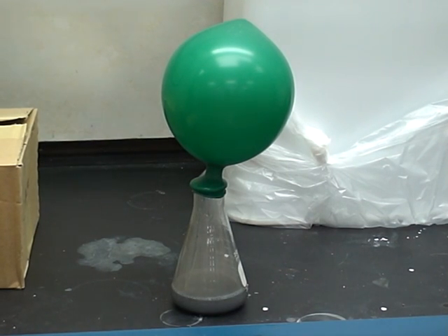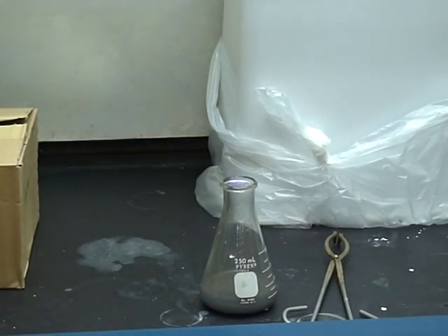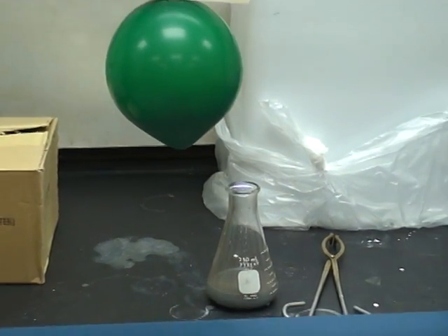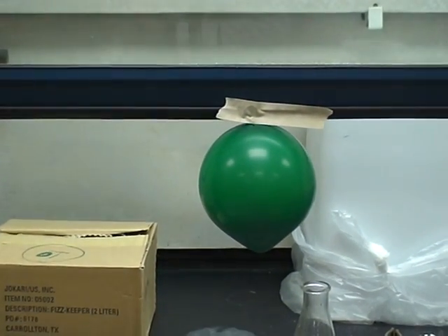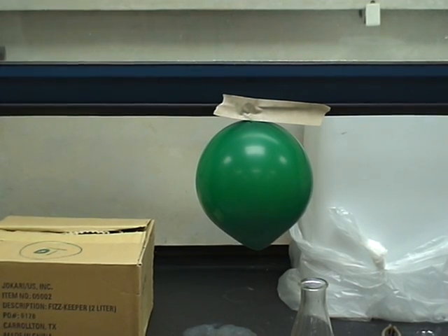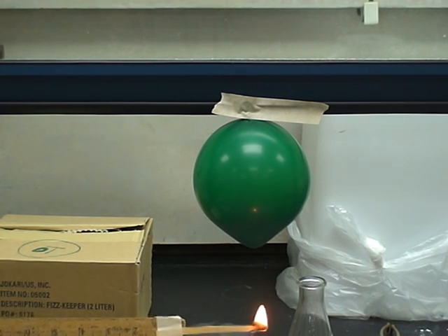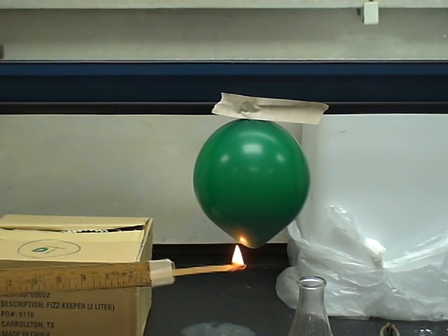Let it settle down for a second. Okay, I've hung the balloon from a place, and I'm going to light a wood splint here. I don't know if you can see it. And I'm going to light that balloon, and we'll see if there's anything in it.